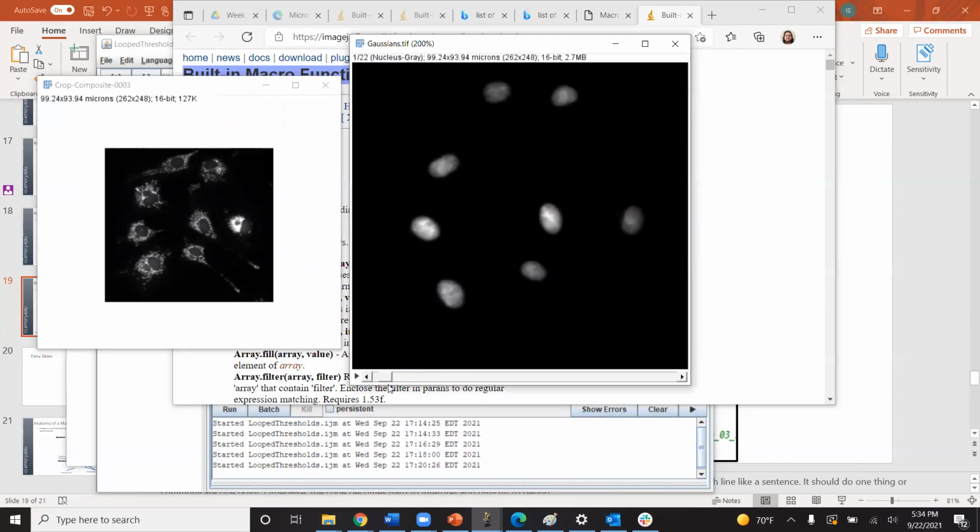So at this point, when am I starting to lose my boundary? Well, looks like it's around sigma 0.4. After that, it becomes very diffuse. But that's the kind of thing you can do with a macro.